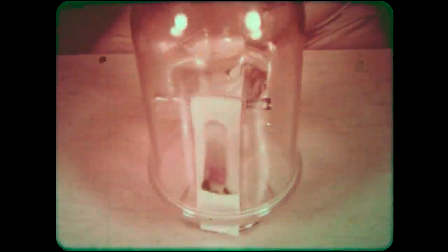Using different methods and solvents, the possibilities are endless for separating mixtures of substances using paper chromatography.